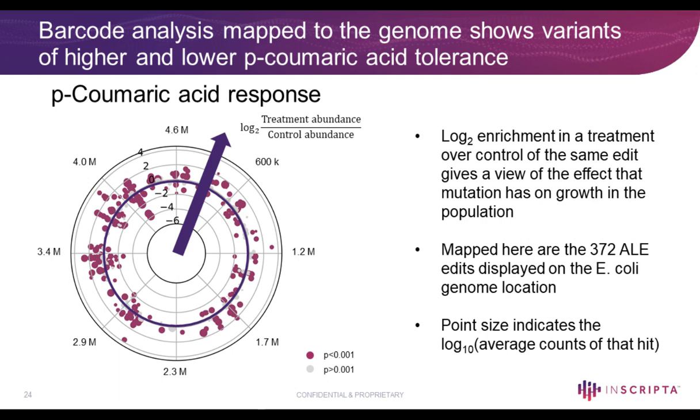They become more susceptible with these mutations being made. Then, as plotted here, you can see that the reproducibility of this data is so pristine that fairly few points show up, but those that are colored have a p-value of less than 0.001.